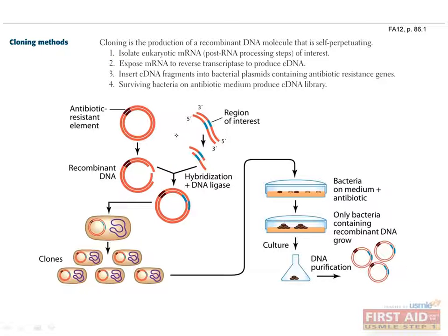Well, you can start with a plasmid that has everything in it already, except for the DNA you're trying to clone. You can buy these at your neighborhood biotech company. There are specific sequences built in, called restriction sites, which are usually 4, 6, or 8 base pairs long, and the function of these is that they can be recognized and then cut by proteins called restriction enzymes. So first, you'll use these restriction enzymes to cut open your plasmid, and then add your DNA of interest to it, and seal them together using DNA ligase.